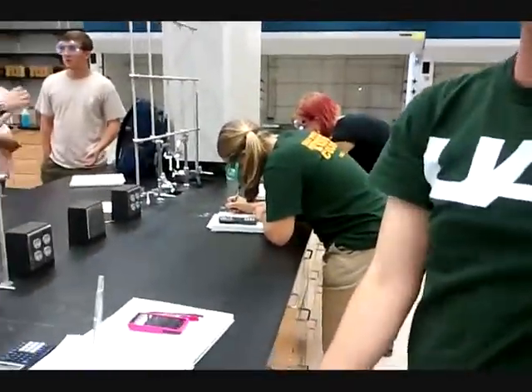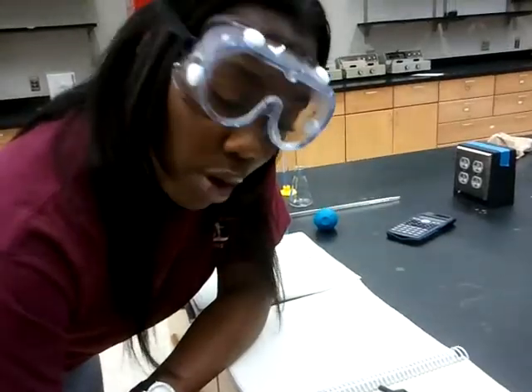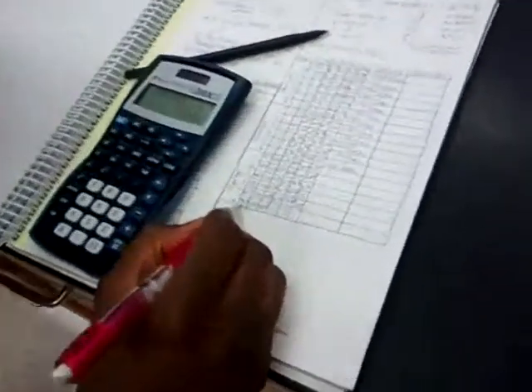Okay, pause it. Now just explaining the values that we just got. Remember from my pipette I measured out 44.2, so that's going to be my initial volume. I'll subtract that from my final volume, which is 100, which gives me my actual volume, which is 55.8. So that's what we have thus far. Now we continue to get our measurements, and we'll come back and record that data as well.